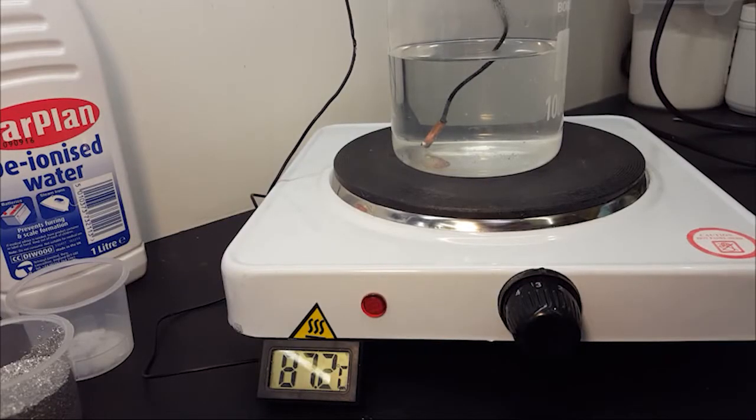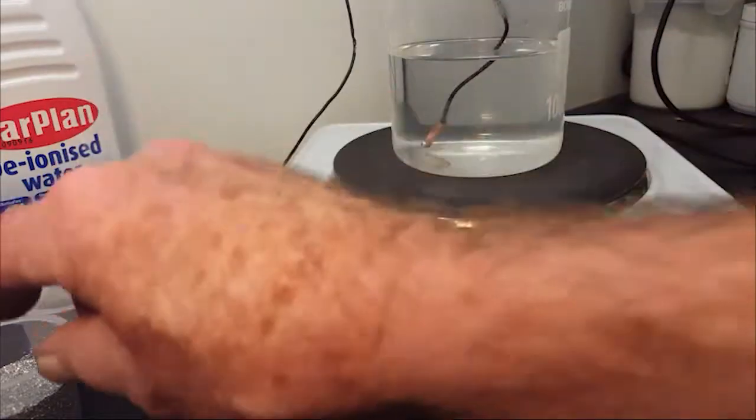In this little experiment you can see how simple it is to produce pure hydrogen from water using a little heat, shredded aluminium wire and our own proprietary catalyst. I'm going to add the aluminium now.